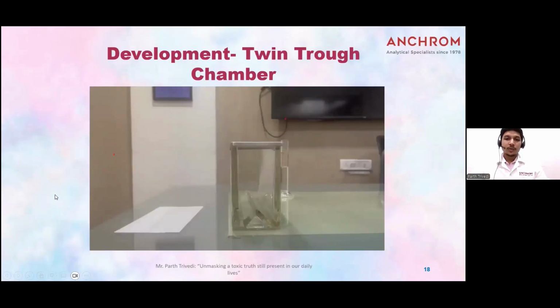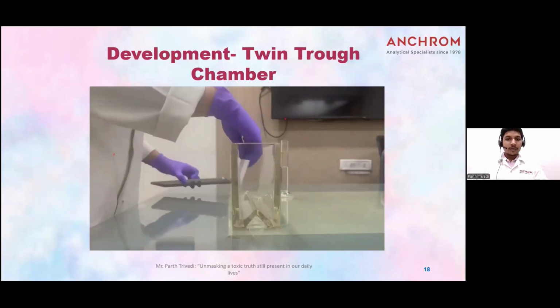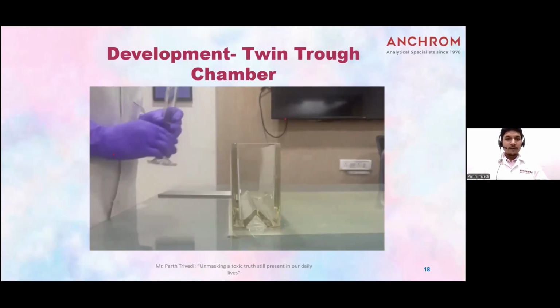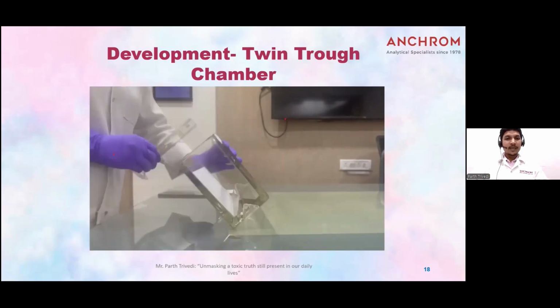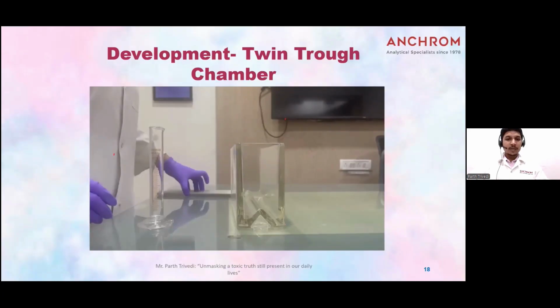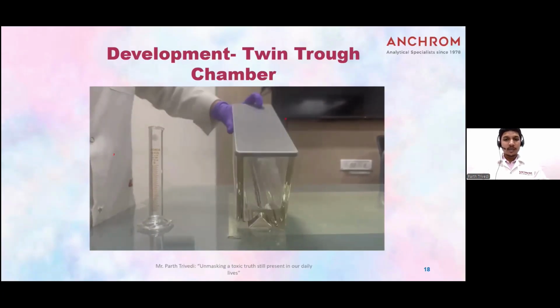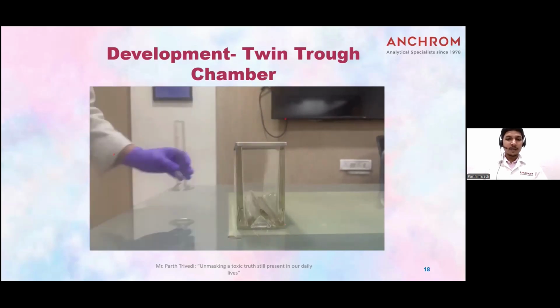Yes, so this is a saturation pad. We put the saturation pad at the front face and pour the 20 ml of mobile phase linearly, and keep the lid above it at a 45-degree angle, so that it divides 10 by 10 in front and rear.